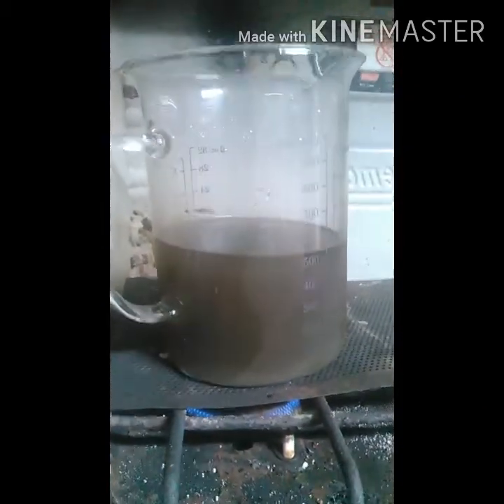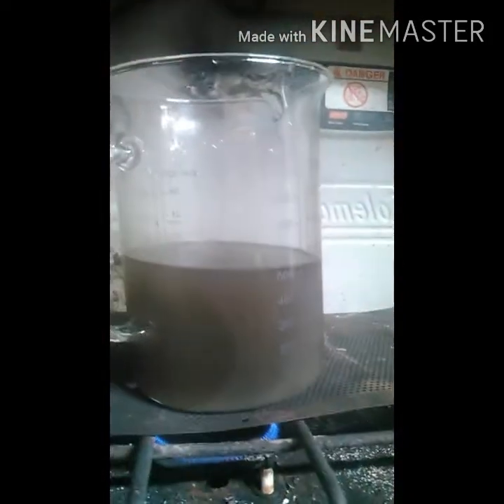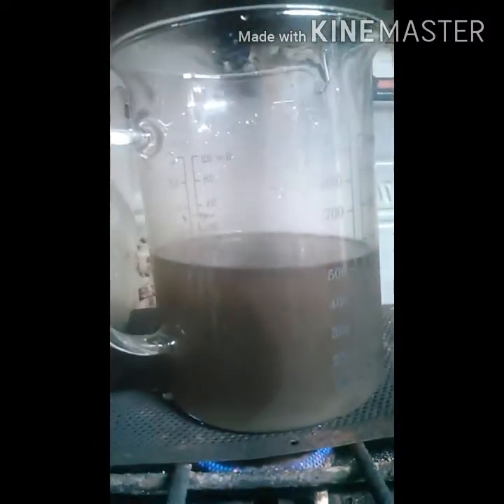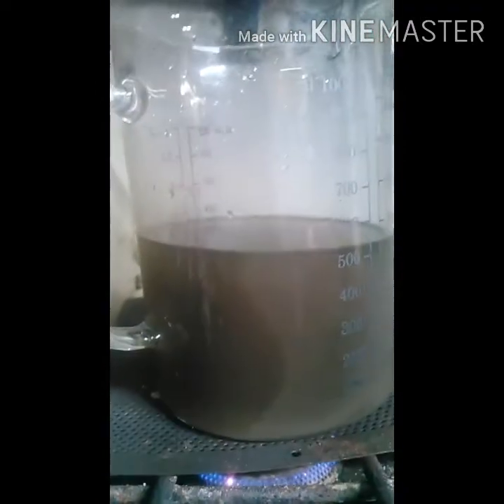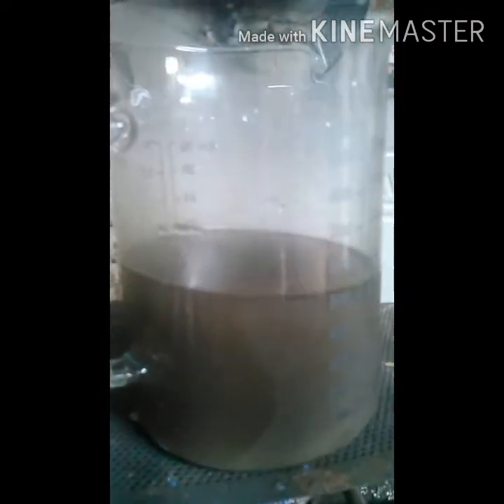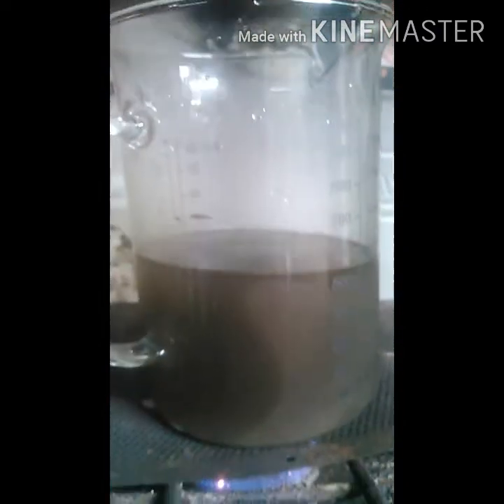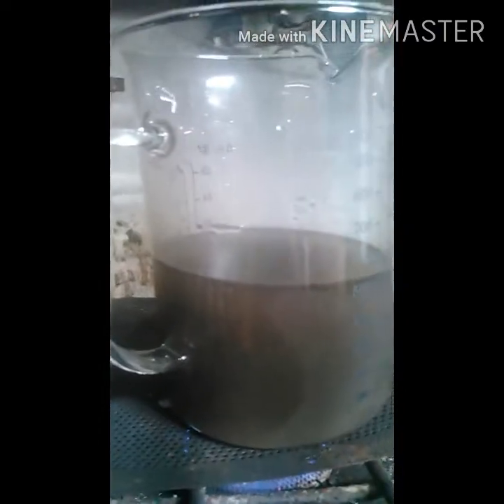I've got it all filtered and now I'm going to boil off some water until I start seeing crystals form, and then I'm going to take it off heat and let it cool. All the crystals should precipitate out, then I'm going to drain off the fluid — that should get a lot more of the coloration away. I'll add water and do it again, and that's going to be my process until I get it down to clear. Whenever I get ready to take this off, I'll show you.